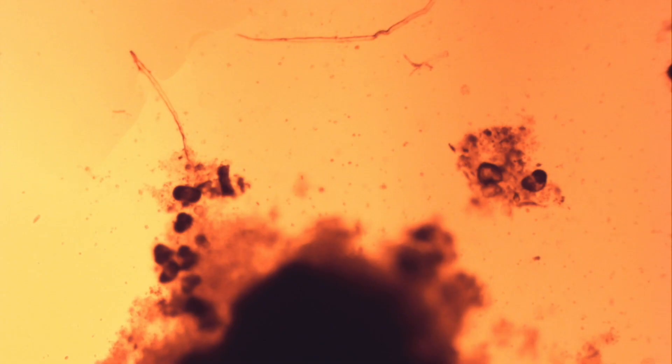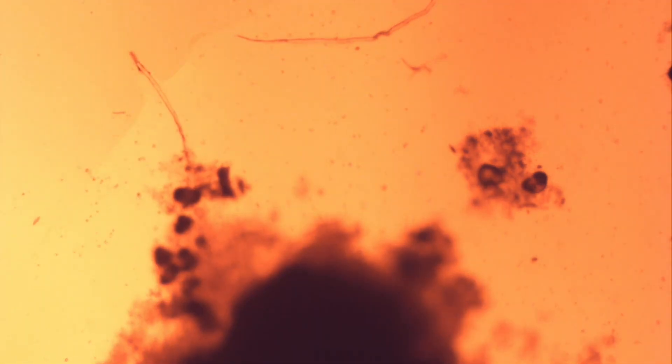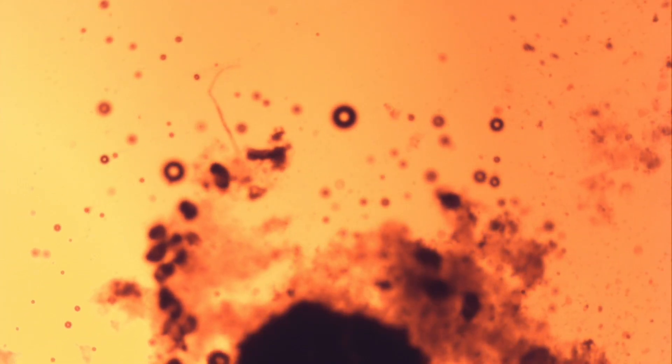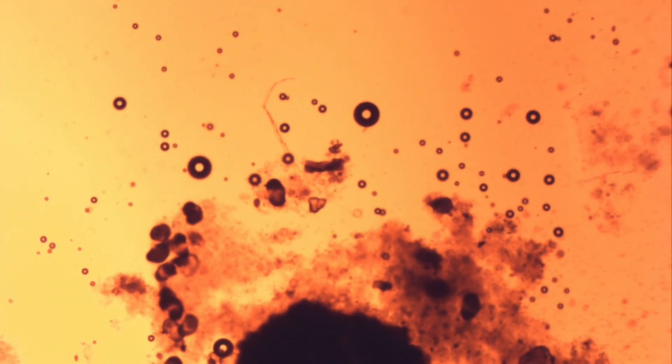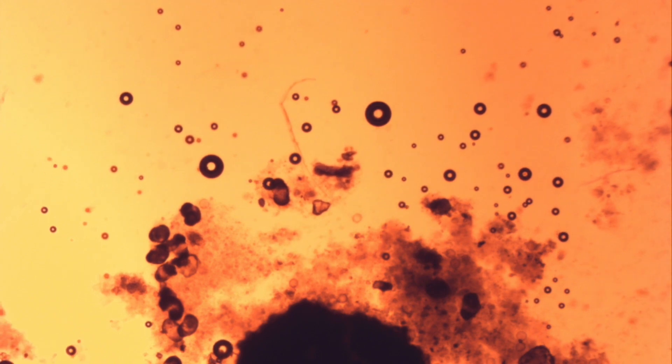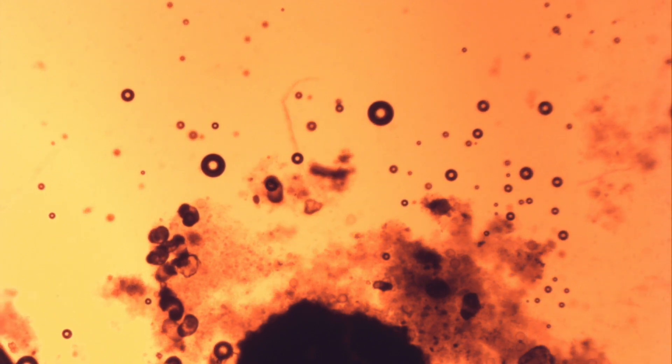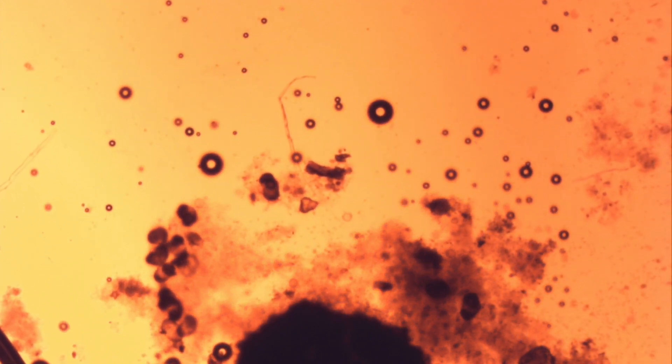Finally, I try putting some dish soap on the underside of a coverslip and dropping it into the water. It was much easier to see, and as expected, most of the activity stops.